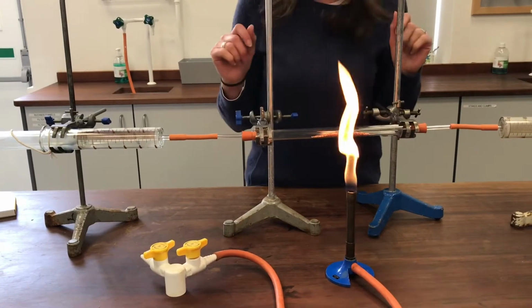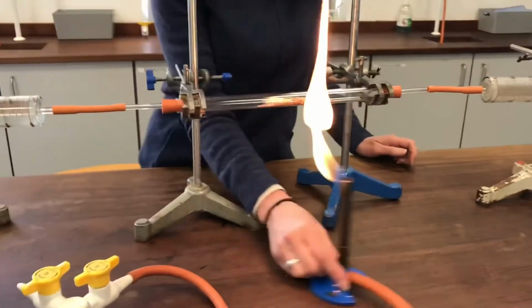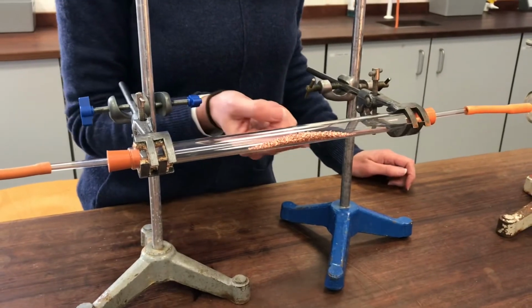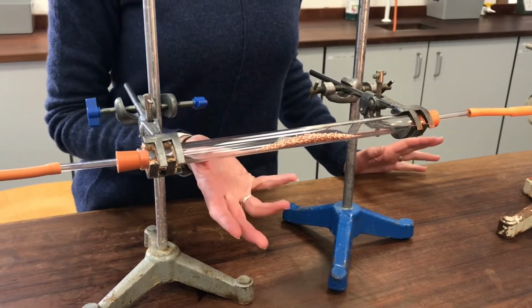This is another experiment to show the percentage of oxygen in air. So what I've got in my central tube here, I'll just move the Bunsen, is some copper. So this is little pieces of copper metal. Now when I heat them, they're going to react with the oxygen in the air and form copper oxide.